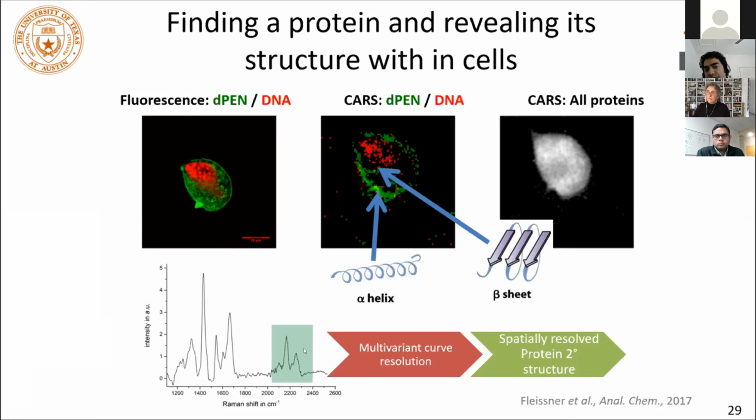The only drawback of those is, well, not drawback, those are meant primarily for imaging things that are otherwise going to be difficult to image or that you want to see for long times, right? Because these don't bleach. That's the other thing that's good about them. They don't really provide the ability to do what I did here, which is extract a spectral fingerprint, because that is fundamentally very challenging in that environment. I think it could be doable, actually, but the more you try to fill in that area with numerous different types of tags, the harder the extraction becomes. Okay, thank you.